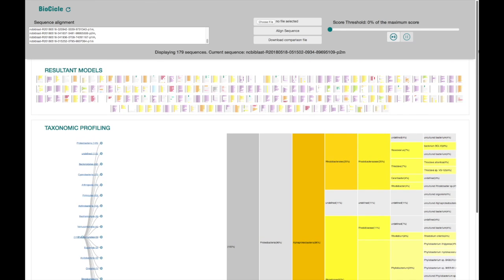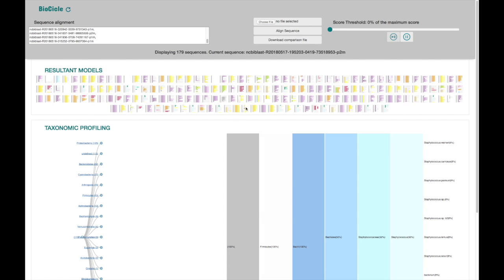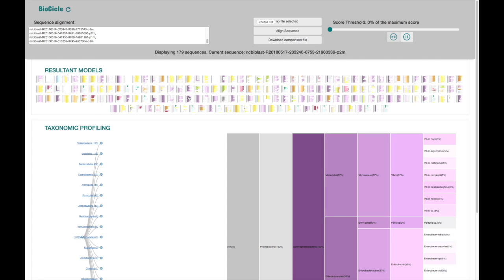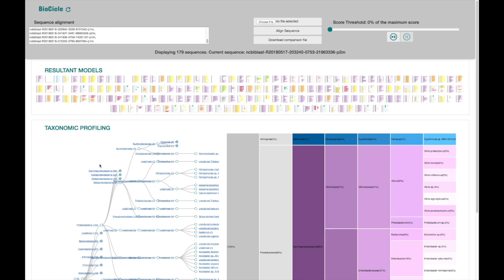The iteration goes through the entire set of results. The small multiples present the taxonomic profiles for each of the results, and the dendrogram shows the taxonomic grouping of the sequences with which the dataset was compared. Considering the amount of nodes it can have, it is presented as a collapsible tree that dynamically expands its nodes according to the number of visible children. The nodes in the dendrogram are sorted following the number of results containing sequences with such node in their taxonomy.